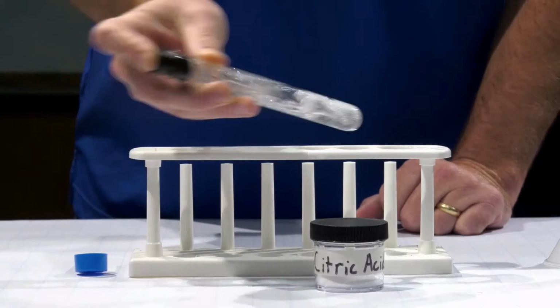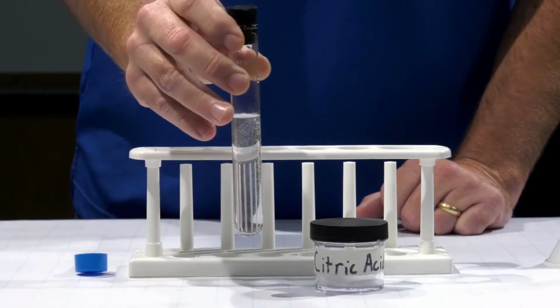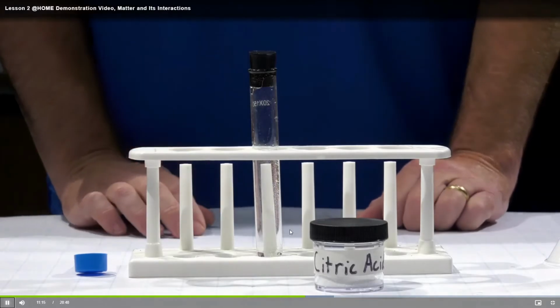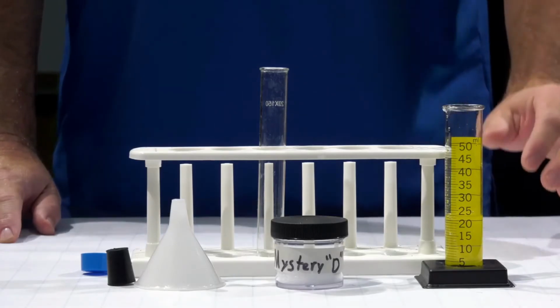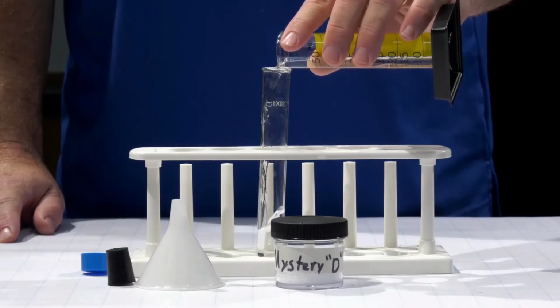Think more shaking than the last time. Might look more clear than the last time, I think. And then we have the last mystery D sample.